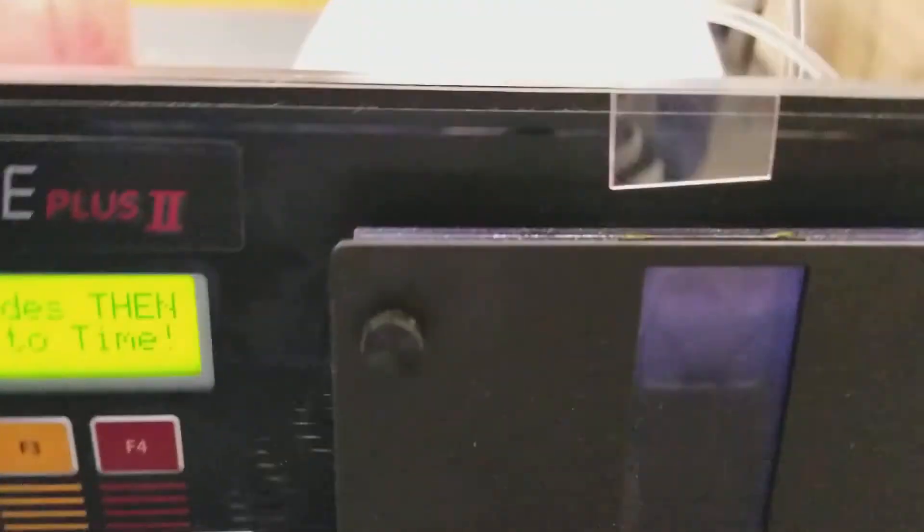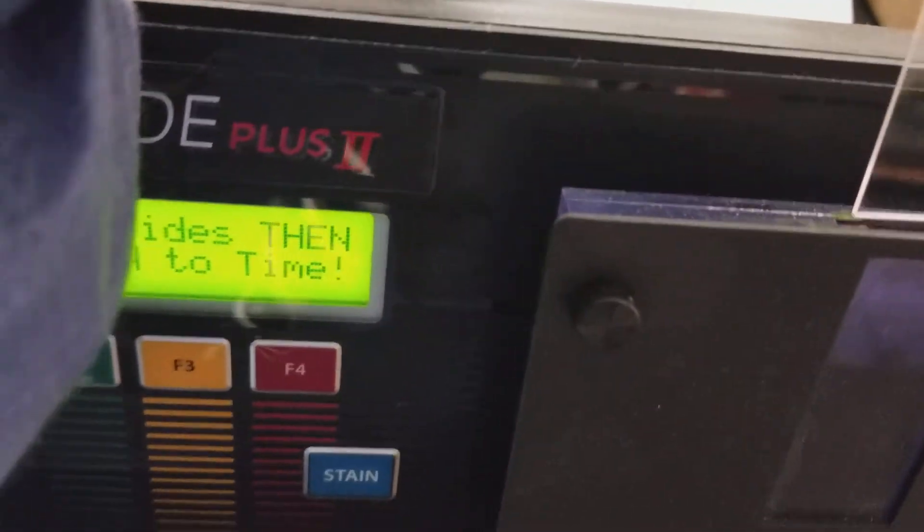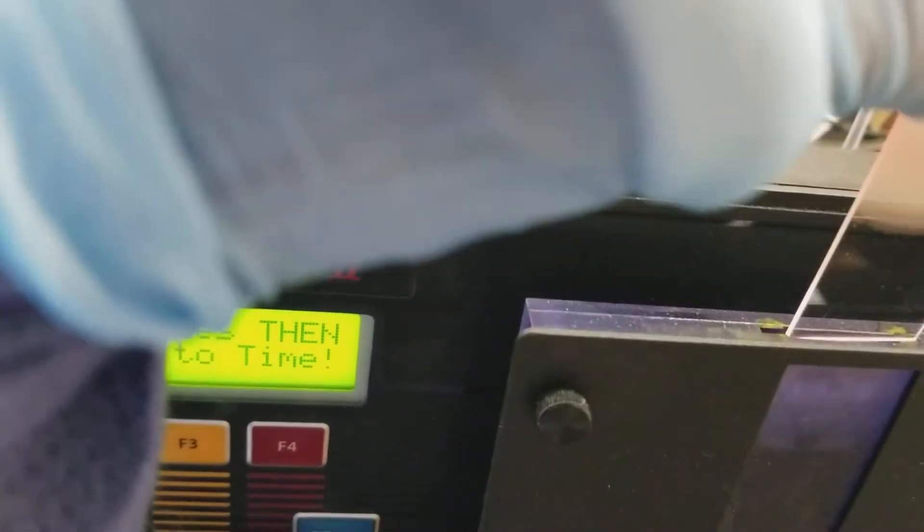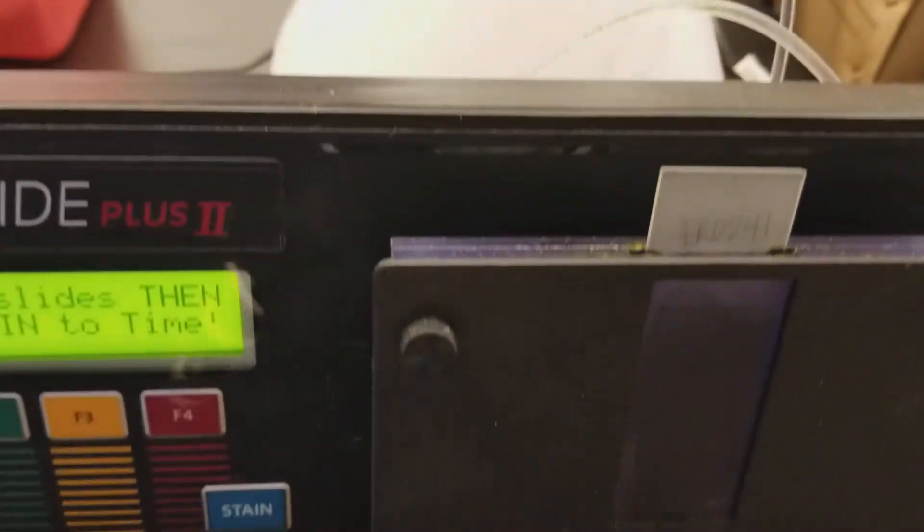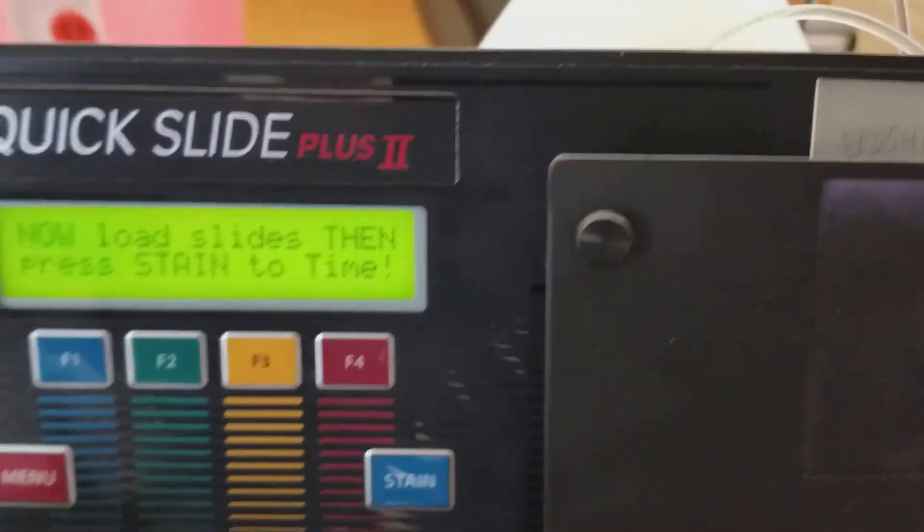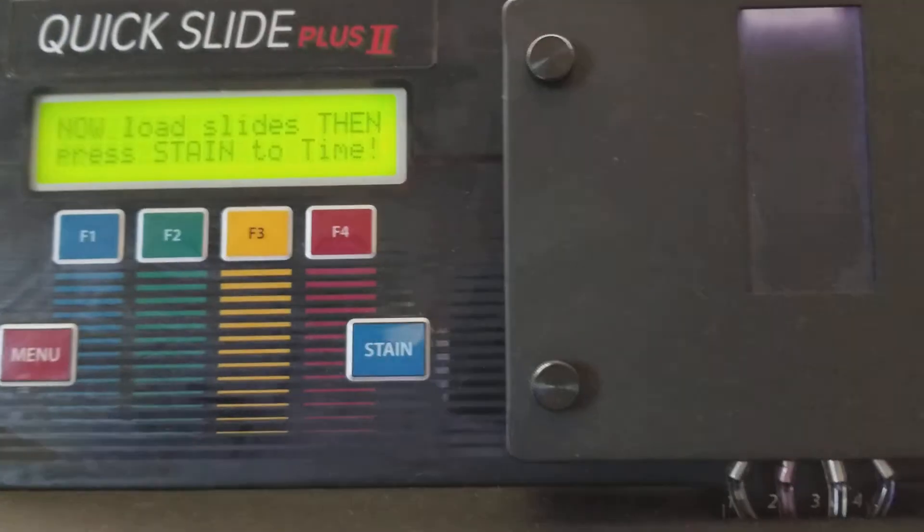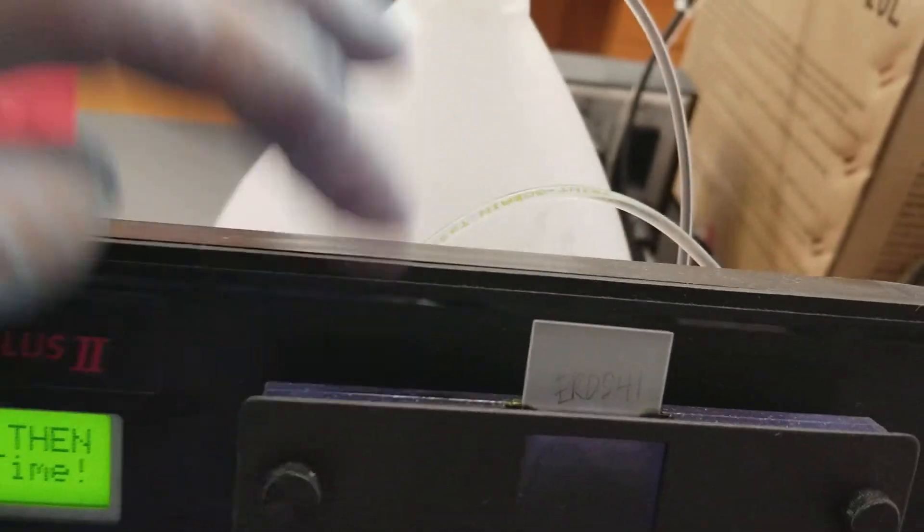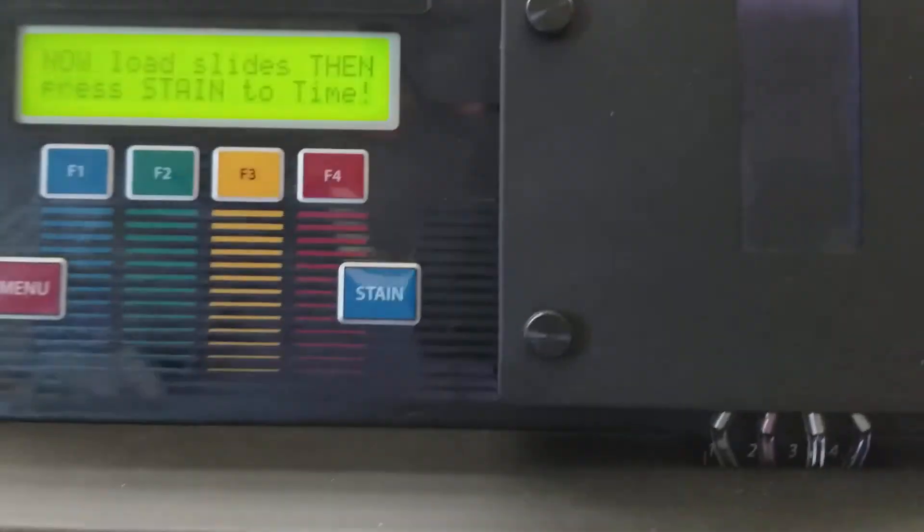There is a little slide holder right there, a little slot. Make sure you look at that when you're putting it in because there is a space in between here and if you put it back there, it's not going to do anything for you.